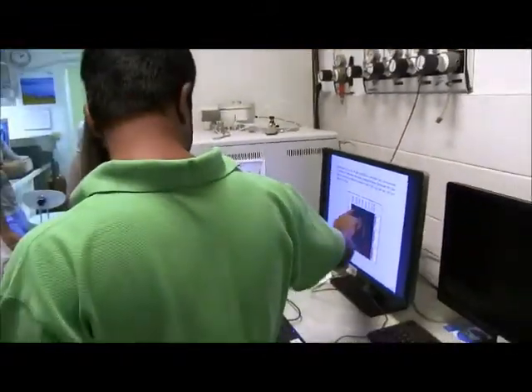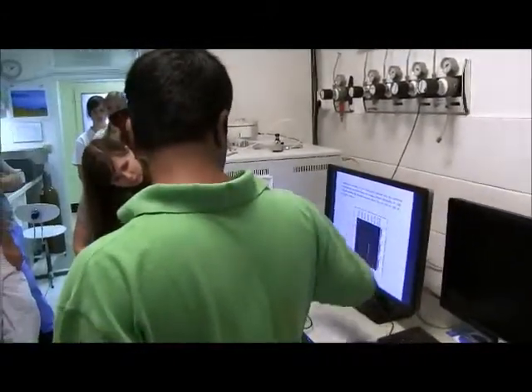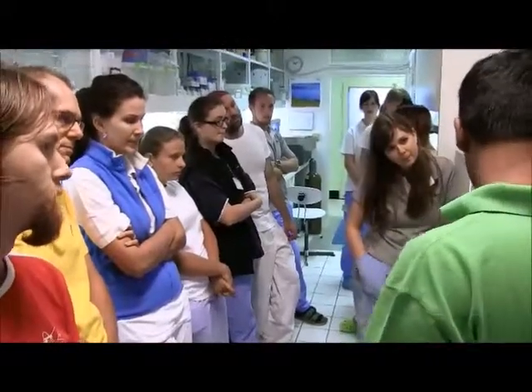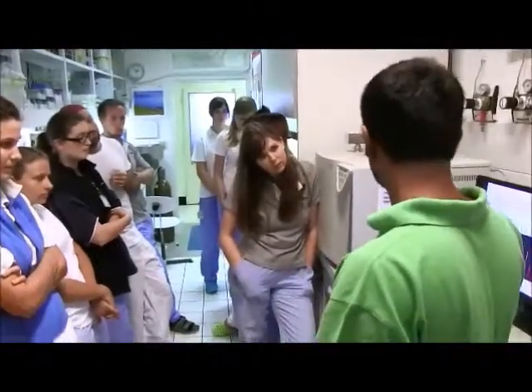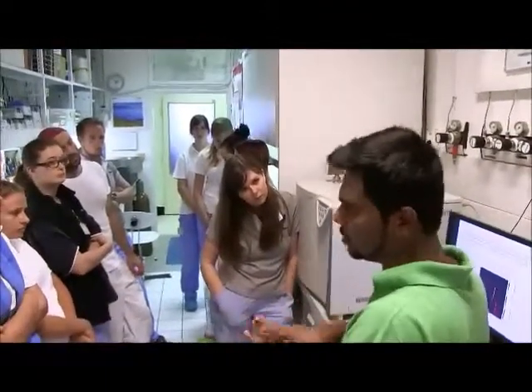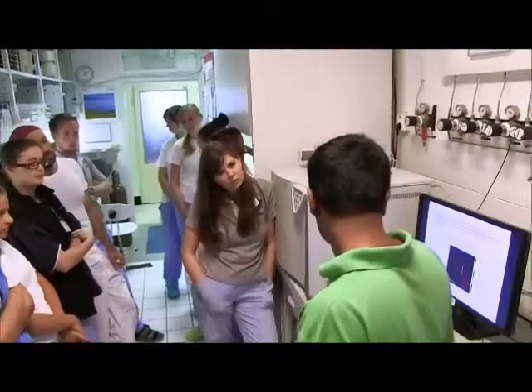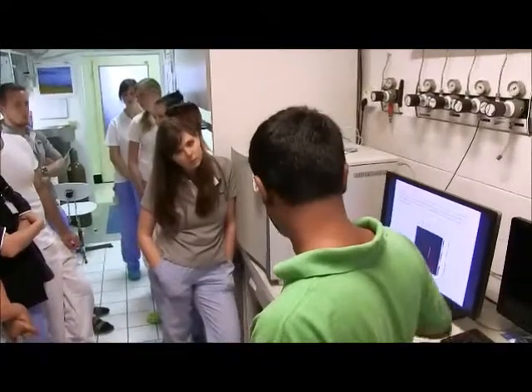We use these tubes, which are plastic-like, polyester tubes, and we use this quantum dot inside the tube and put that tube inside the tissue. We wanted to know the fluorescence intensity, or the capability of getting fluorescence, if we inject it in the tissue. Sometimes it happens that if we inject it, it mixes in the tissue, and in that case we don't know the exact fluorescence intensity or the activity of that quantum dot in the tissue. That's why we use this tube, and later on we also use the injection. We will see.